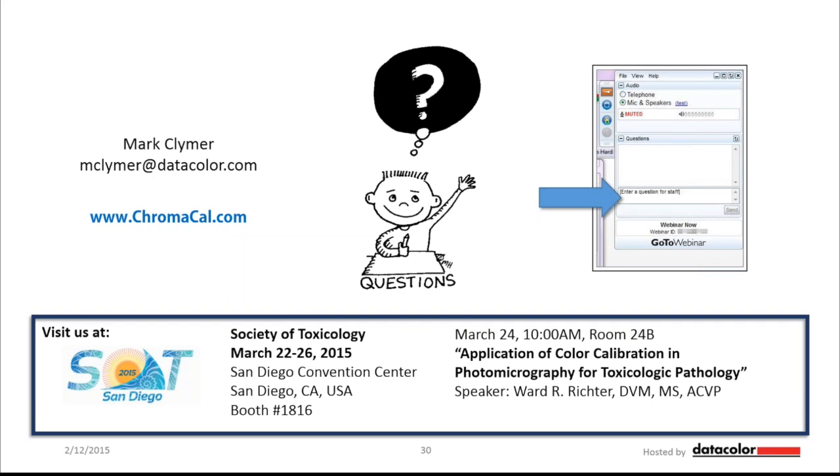So there really isn't much sense in adding any additional patches. These do a pretty good job, although there is work out there by other groups to look at additional approaches.